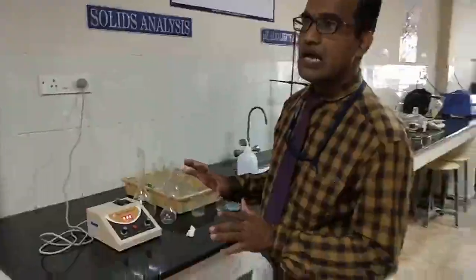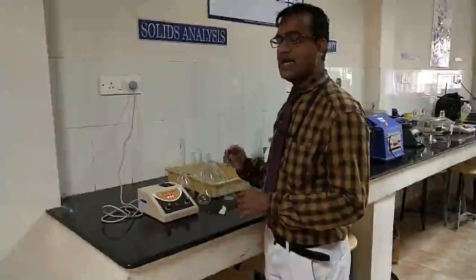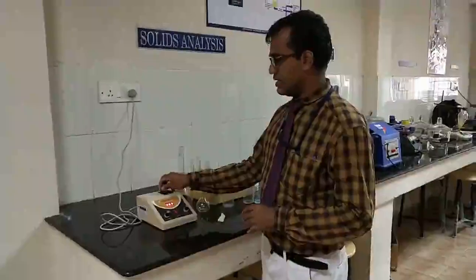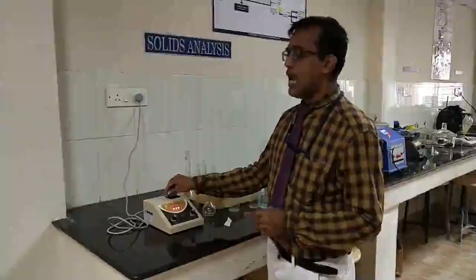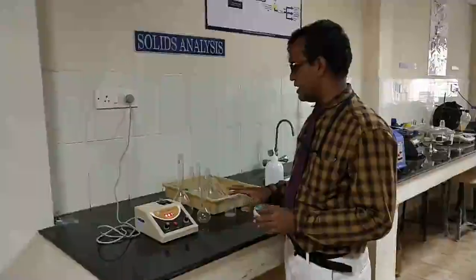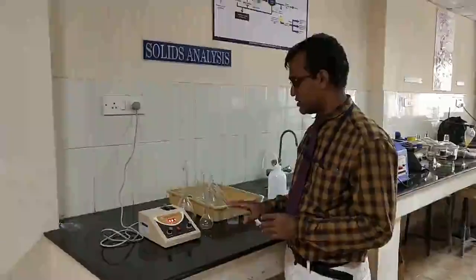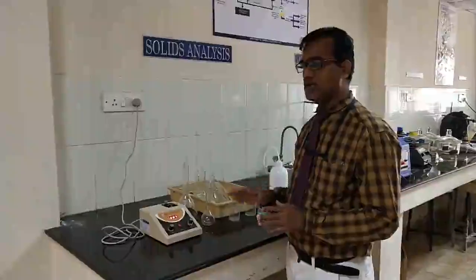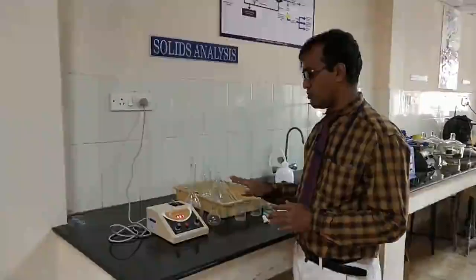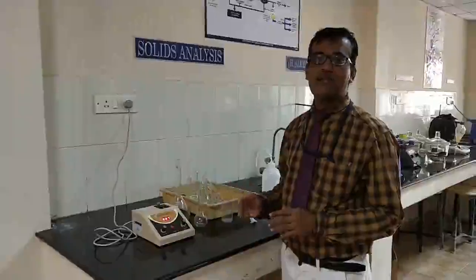Once the standard values are measured, then you take the unknown sample, and in a similar way take it in the cuvette, put it in the sample holder, and find out the absorbance. So you have the percentage of transmission of the unknown value and also the percentage transmission of the known values. Then you have to plot the known values against the required concentration in ppm, and by using that graph you can calculate the unknown values. So that will be easier.